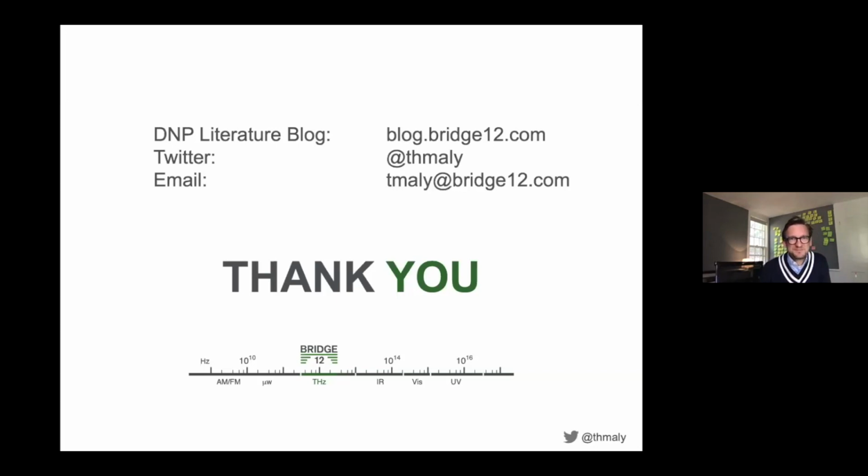And we found ourselves another question from Frederick Mentink, asking, is a frequency agile second harmonic gyrotron harder to design? It's harder than the fundamental mode gyrotron. Yes. Is it impossible? No, I don't think so. I think that's a good question. But everybody who would start with this is probably well advised to first start with the fundamental one and then go to the second harmonic. But I don't see a reason why this shouldn't be possible.